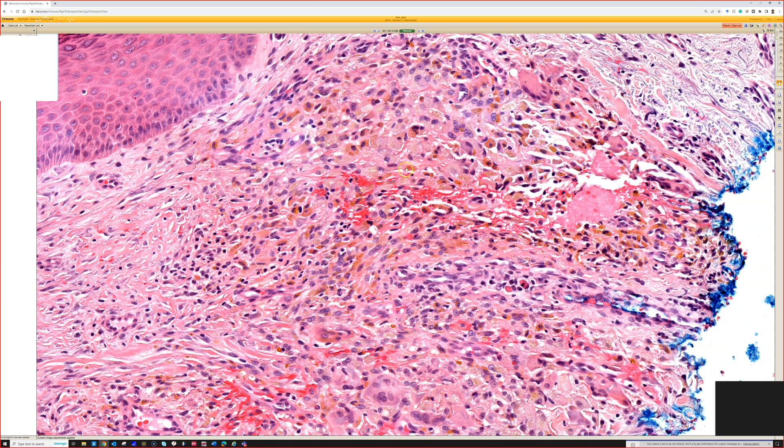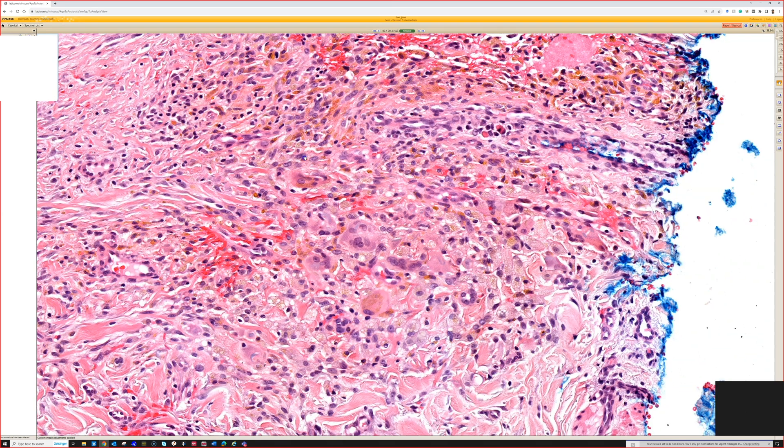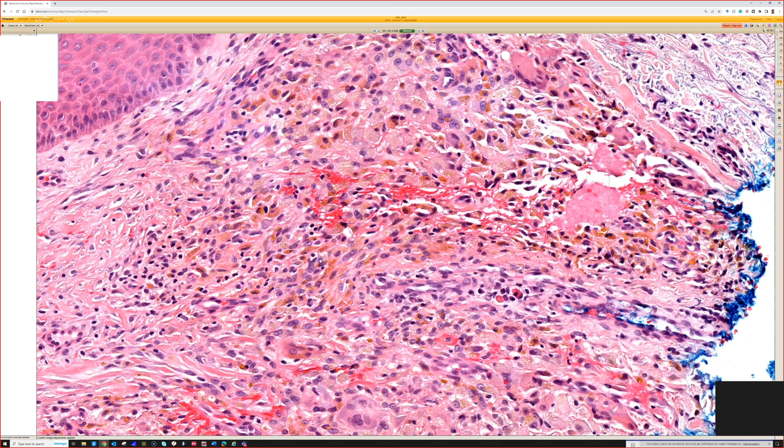I have actually seen times where trainees who had never seen this before thought it was maybe some spindle cell melanoma or something. This case is not very typical, but I have seen Monsel's reactions that were really brisk and robust with a spindly response — quite different and more cellular than what you would see with aluminum chloride.